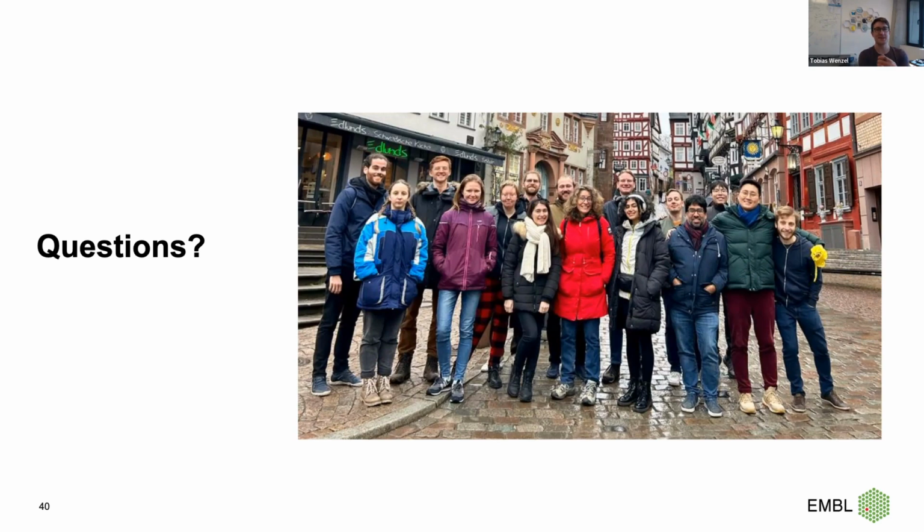But I guess the good thing is that in Ilastik you can already fix them up, right? You can import the model, see if it helps, and then manually define some things to improve it on your images, I guess. Not really. With the normal neural networks, you are basically done once you download it. There's no correcting them, because retraining or fine-tuning such a neural network is not enough with just a few brush strokes. But you can combine it with the random forest model afterwards. Okay, I see. So it's one or the other.